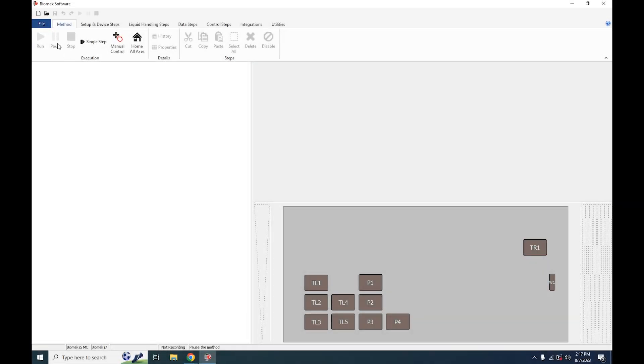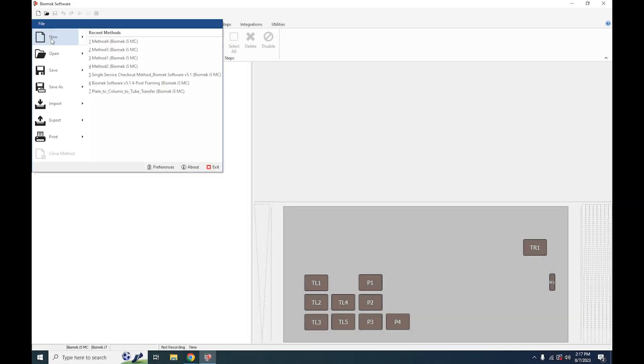The first thing we need to do is create a new method. We're going to do that by going under File and hitting New, or clicking the empty page icon in the top left corner.